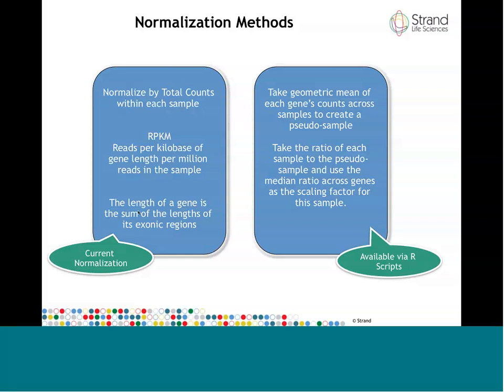A common question that's asked is, is there a way to visualize and look at the RPKM values and look at them in plots, etc.? And absolutely, you can. Avadis NGS computes RPKM values. It can show you RPKM values in scatter plots, profile plots, box whisker plots, etc. So you've got the whole works in terms of visualization of these values.